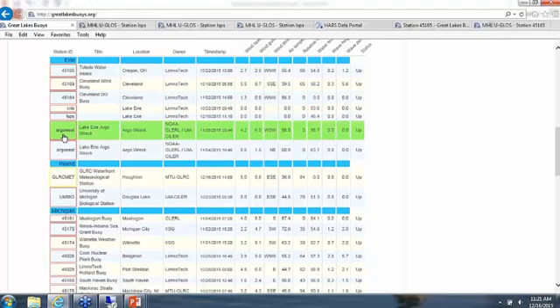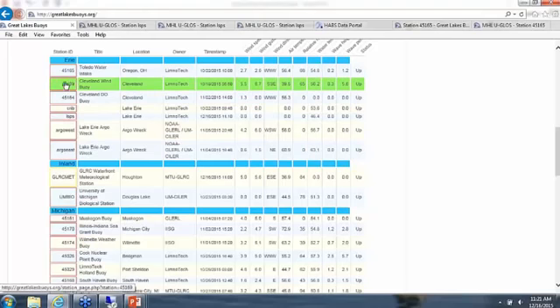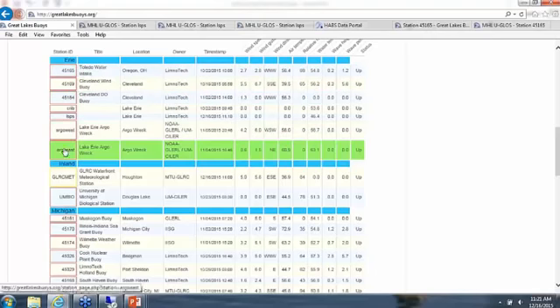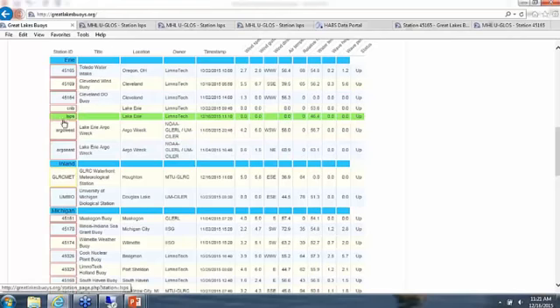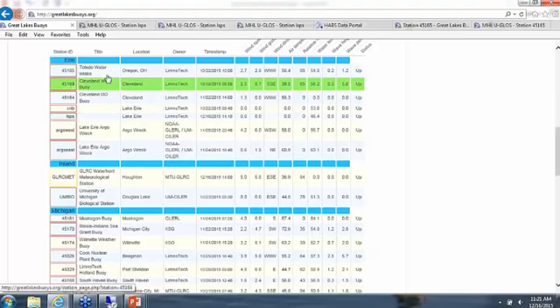So one of the really nice things about having the buoys in the lake and in the water plants at their low service lift station or at their crib is that you can see data from other places. So Toledo and Oregon tend to be fairly close together, and I know we've got Cleveland and Cleveland. This is Toledo's crib, this is Toledo's low service pump station, and this is the buoy link. So you can go in and see all of those.